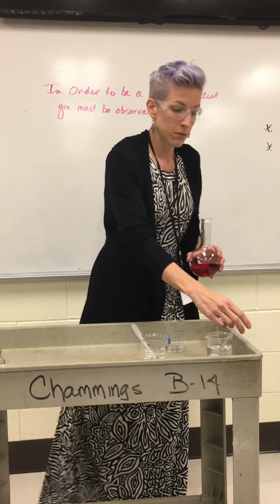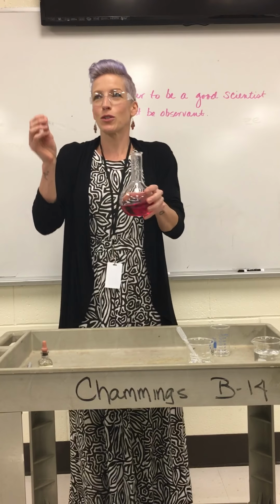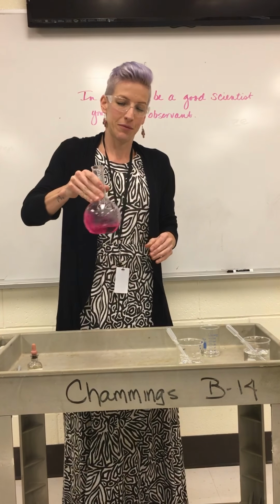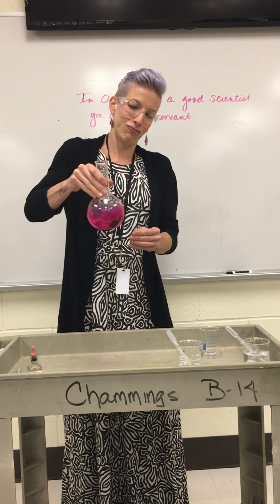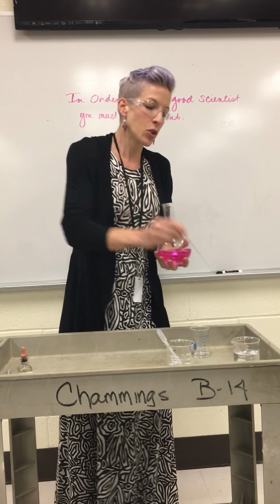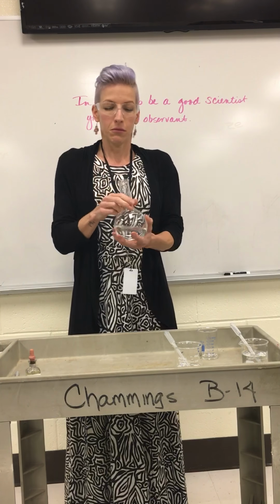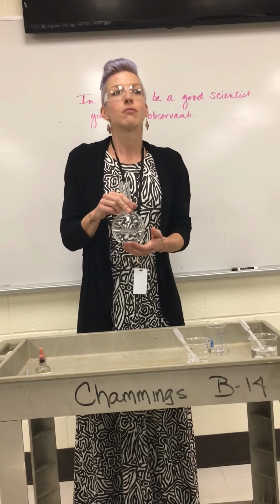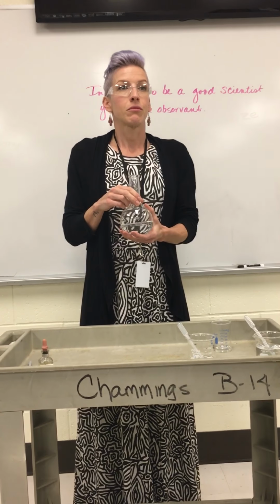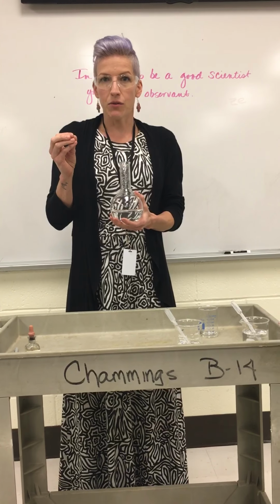All right, so what do we want to do? More pH. No, pH is already in there. It doesn't need any more. So just A, right? Swirl it. So what are you noticing about the relative amounts? If there's more B, it turns pink. Right? Okay, very good. So the more pink you add, I guess it overpowers the A. Gotcha. Okay. So the relative amounts of things are mattering.